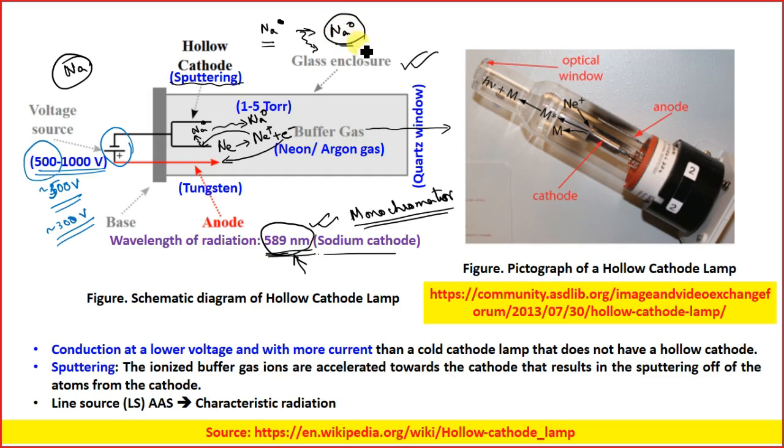When I say sodium metal, I am talking about sodium at the atomic level. As I said, the lamp removes atoms from the cathode. When the atoms are removed they are at a high energy state, then go into the low energy state, and give a lambda max, or lambda sodium maybe.